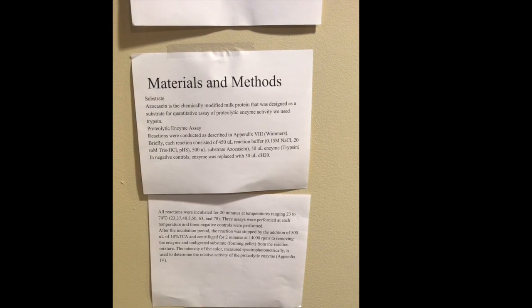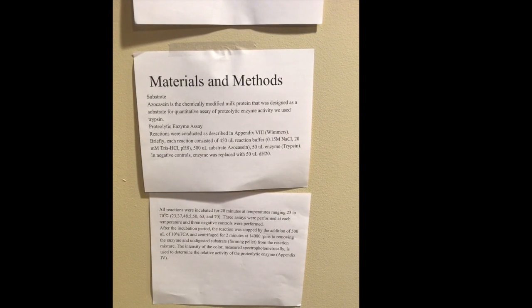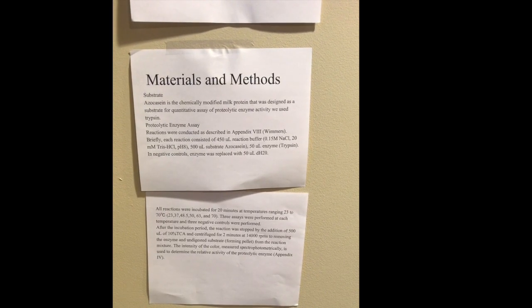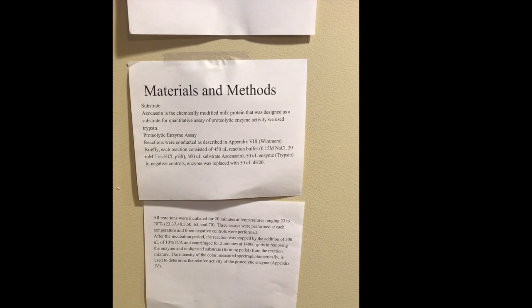For each of the given tubes tested at the specific temperatures described, we added 450 microliters of the reaction buffer. Our reaction buffer included sodium chloride and Tris-HCl at a pH of 8. We also added 500 microliters of the substrate azocasein and 50 microliters of the enzyme trypsin. Each of the experimental tubes was incubated for 20 minutes at the desired temperature in a hot water bath.